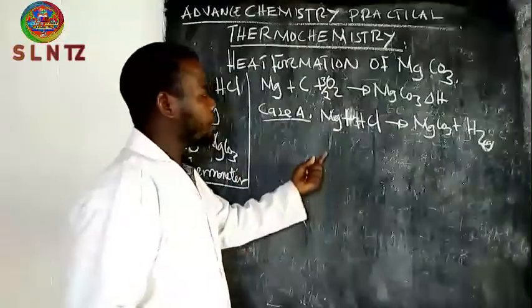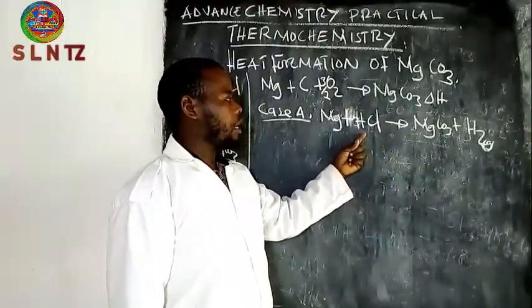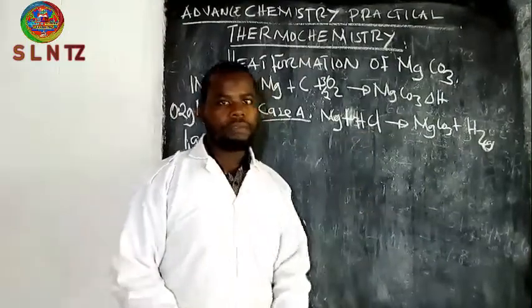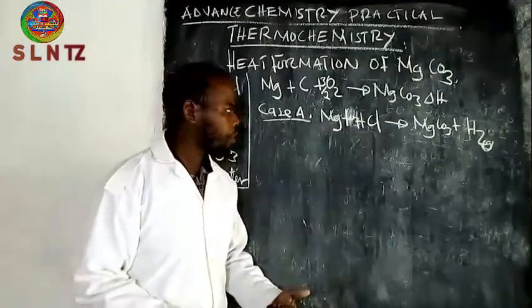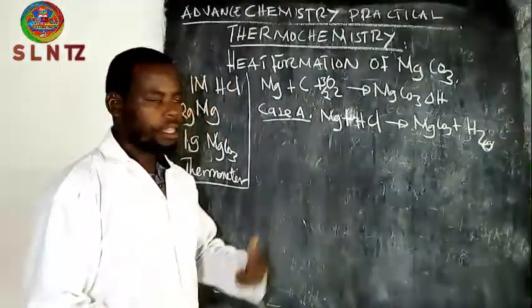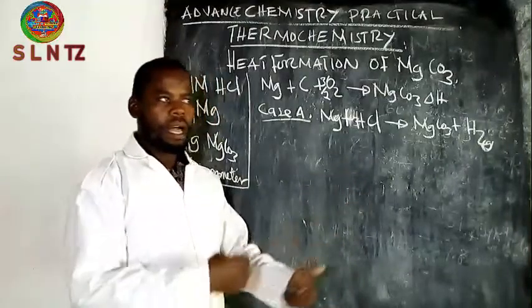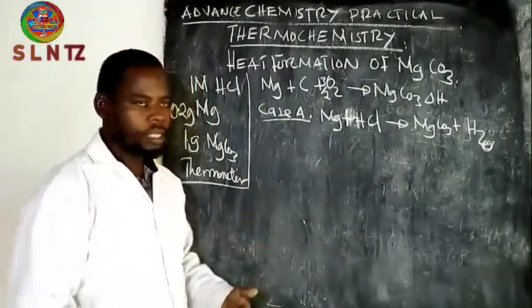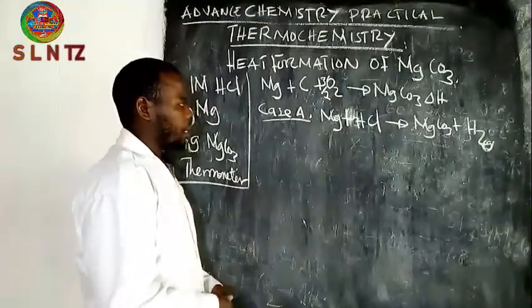Then we record the initial temperature of the hydrochloric acid, and after the reaction we record the final temperature, and then we record the temperature change. In the previous lesson on introduction, we talked about heat change and other concepts.